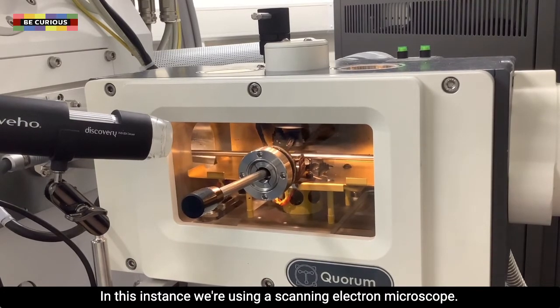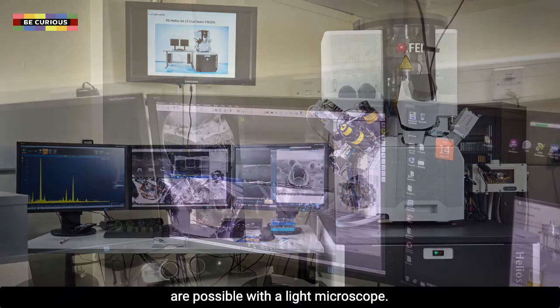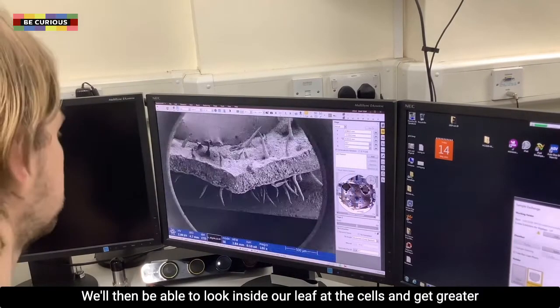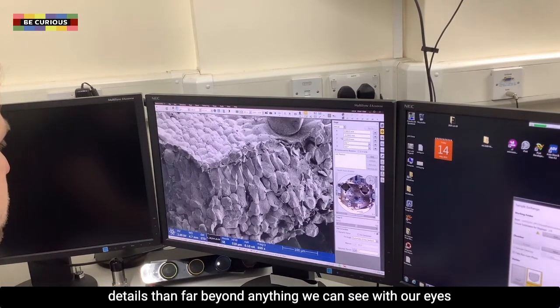In this instance we are using a scanning electron microscope. We are using this as we can get higher magnification images than are possible with a light microscope. We will then be able to look inside our leaf at the cells and get greater detail far beyond anything we can see with our eyes.